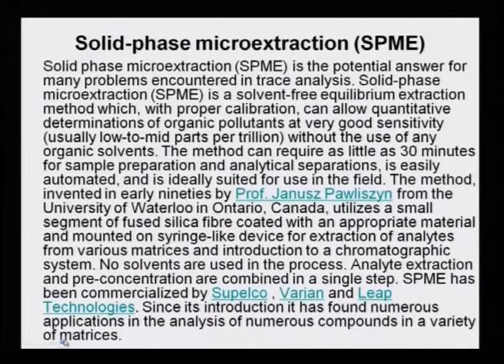Solid phase microextraction is similar to solid phase extraction, except that it is primarily meant for smaller quantities, as the word micro is incorporated. So, SPME is the potential answer for many problems encountered in trace analysis.